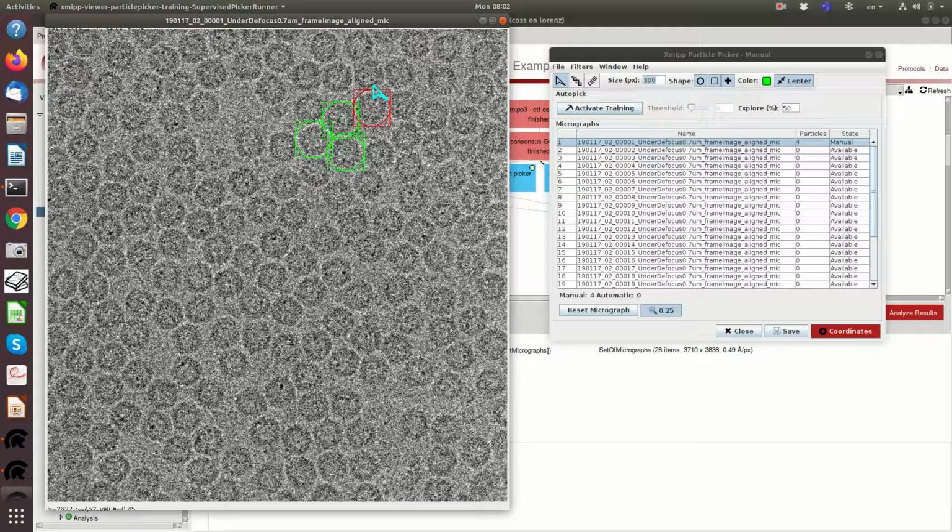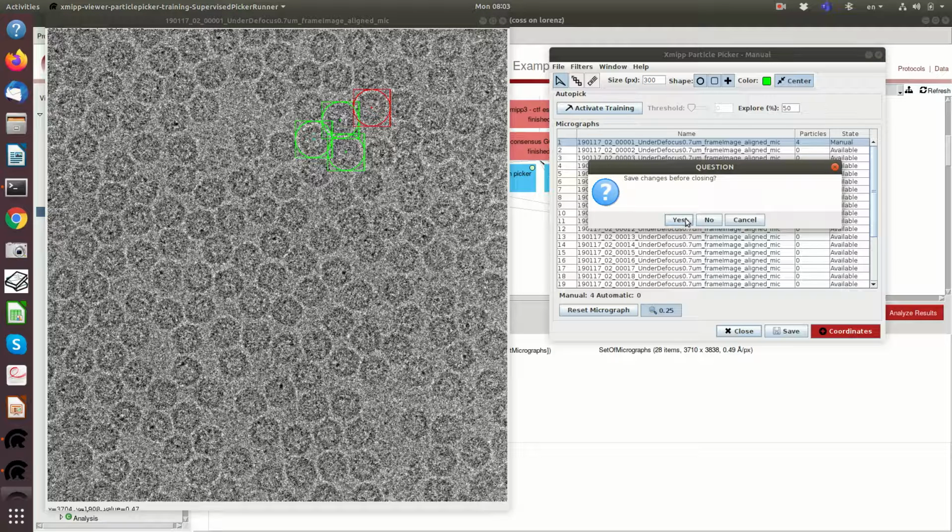If you teach that the box size is something big and the particle should be isolated inside, it also learns that. So I prefer picking with tight boxes, and then later at the 3D reconstruction, it is true that we have to enlarge the box size so that we can correct for the CTF in a better way. But otherwise, this is good for picking.